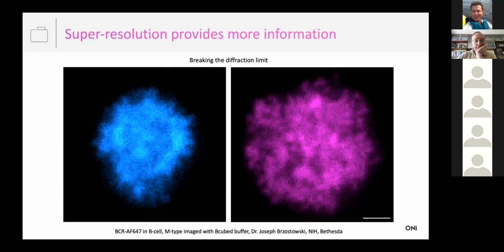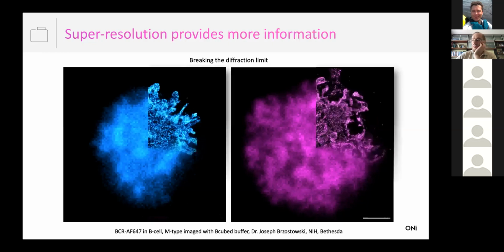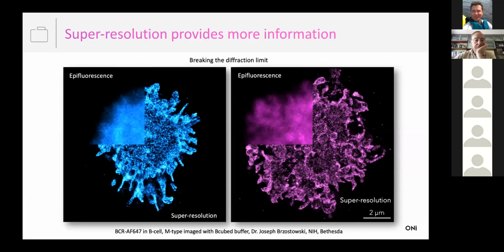Unfortunately, the techniques used were limited in the resolution they could achieve, and consequently it created a barrier. Super resolution microscopy refers to a class of techniques that are able to break this barrier so that we can visualize with unprecedented detail cellular contexts at a single molecule level.